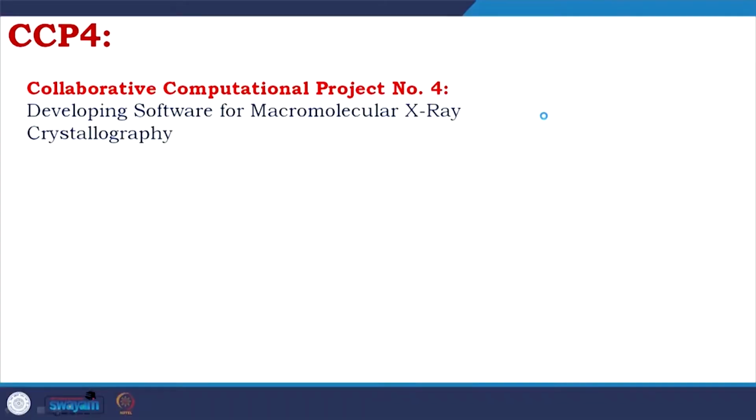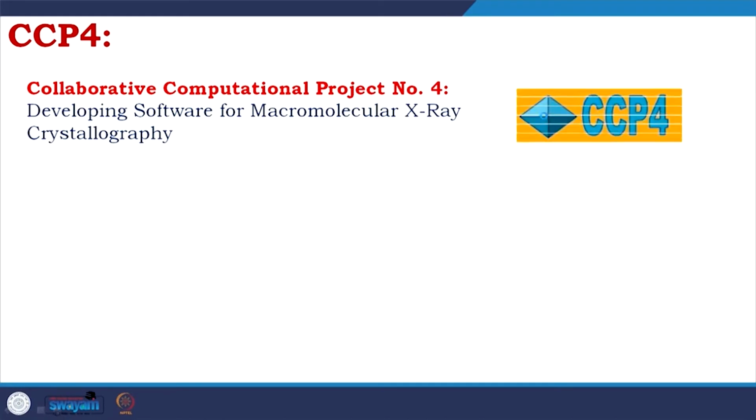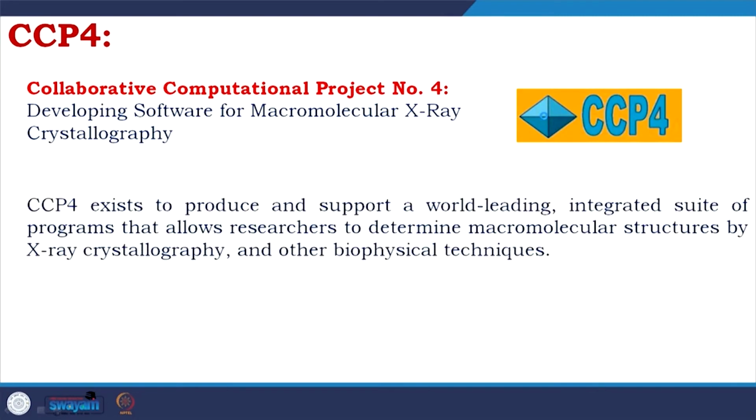And before going to the next step, I want to introduce CCP4. CCP4 is Collaborative Computational Project 4. It is a developing software for macromolecular X-ray crystallography. This is the logo of CCP4.